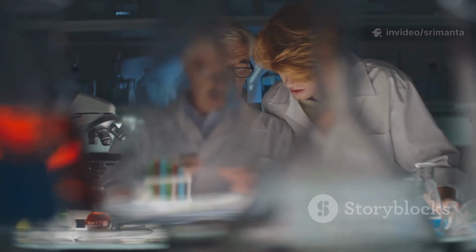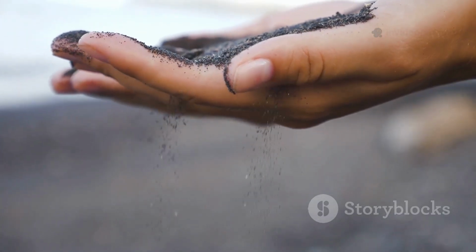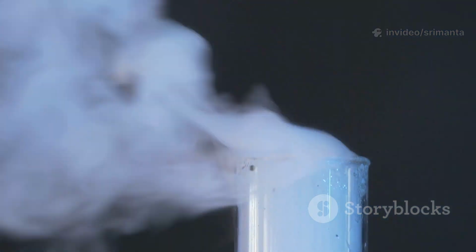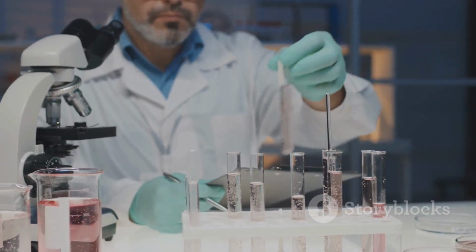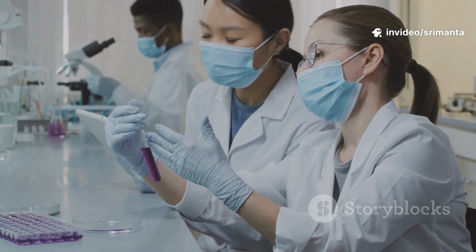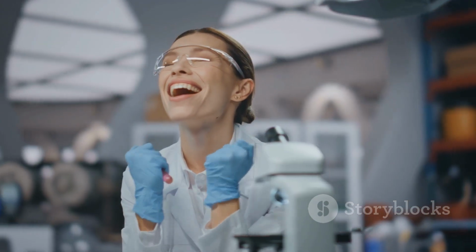Why is this conversion to a gas so important? Imagine trying to find a single grain of black sand on a huge, dark beach. It would be almost impossible. But what if you could magically turn that one grain of sand into a puff of colored smoke? You would spot it instantly. That is what we are doing here. We are taking the tiny hidden arsenic and converting it into a chemical signal, the arsine gas, that we can easily guide and detect. This conversion is the key that unlocks our ability to see the unseeable and ensure our products are safe from this sneaky contaminant. It is a beautiful example of using chemistry to solve a real-world problem.